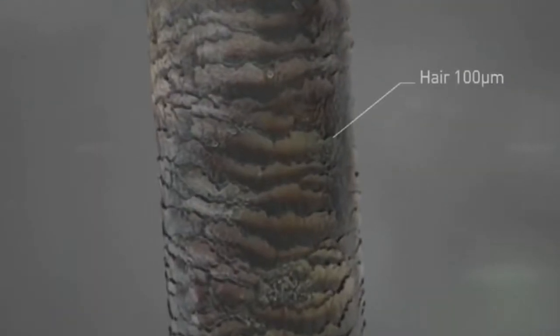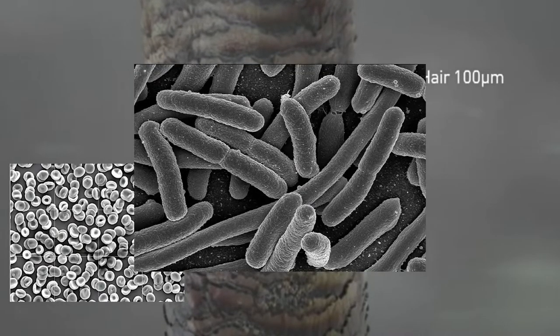In research labs, it is often necessary to visualize tiny objects. For example, in a biolab, one may need to observe cells, bacteria, or a virus.